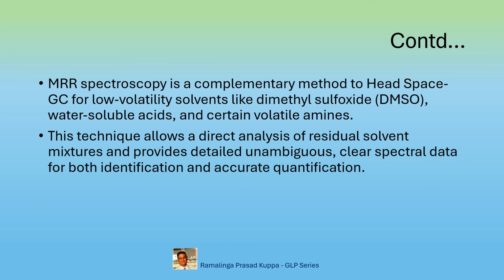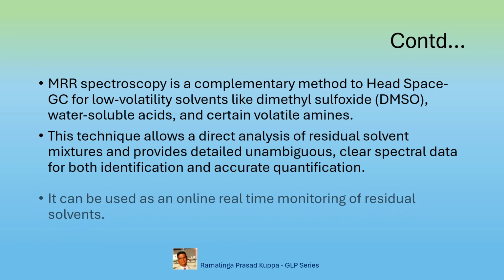This technique allows a direct analysis of residual solvent mixtures and provides detailed, unambiguous, clear spectral data for both identification and accurate quantification. The sample solution can be directly injected into the system for analysis.